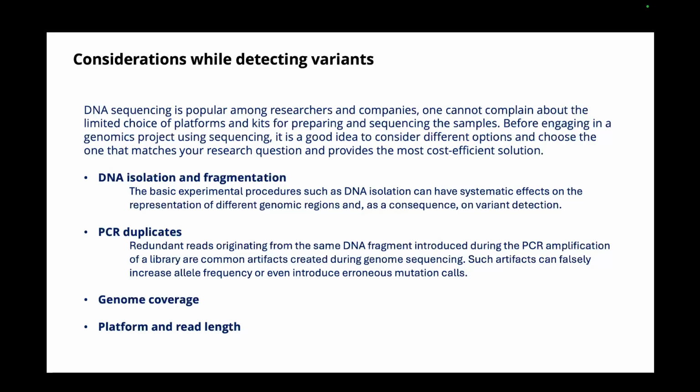The fourth and the final point that comes into play is the read length and the platform eventually. So, as we know, Illumina gives around 150 base pairs of read length. So if you have two opposing reads, read one and read two, which are basically your paired reads, including read one and read two, you get around 300 base pairs. And if there's an insert size, it's slightly above that. Maximum, it's around that 500 to 600 range, considering read one, read two, and the insert.